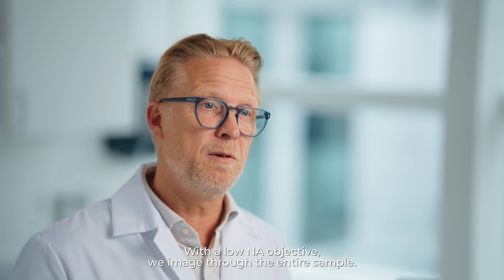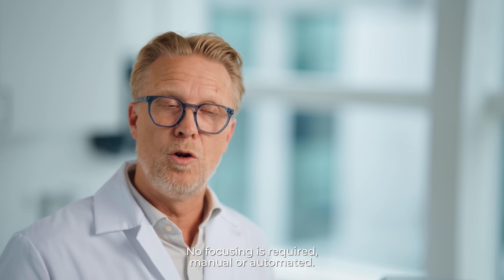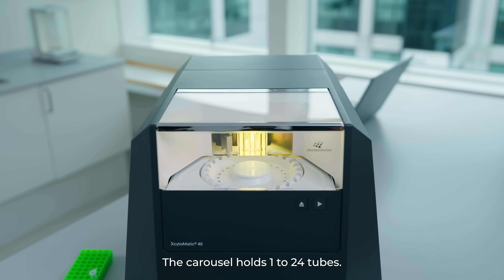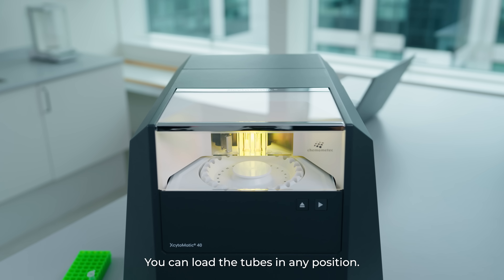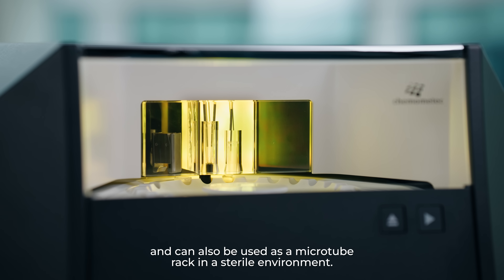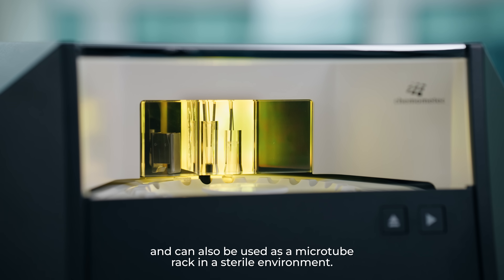With a low NA objective, we image through the entire sample. No focusing is required, manual or automated. The carousel holds 1 to 24 tubes. You can load the tubes in any position. The carousel is autoclavable and can also be used as a microtube rack in a sterile environment.